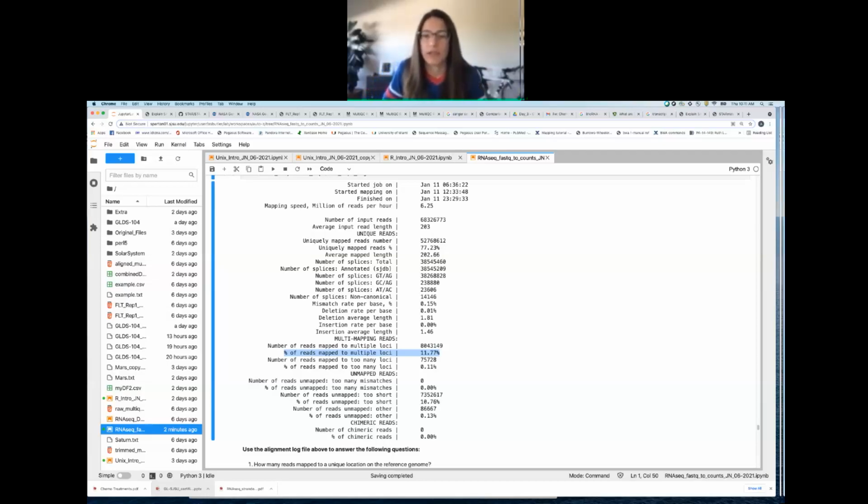Yeah, Diksha, Zaru, Leah, Hannah Lee. All right. So the question was, how many splice regions are identified? Oh, wait. Some of you guys are right. I'm sorry, looking too fast. Yeah, so Zinru, you're right. Diksha, you're right. Aowen, you're right. So Hannah Lee and Leah, I think we're looking at the number of annotated ones.